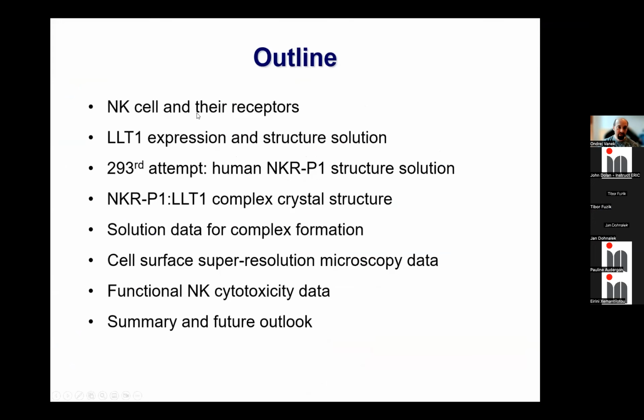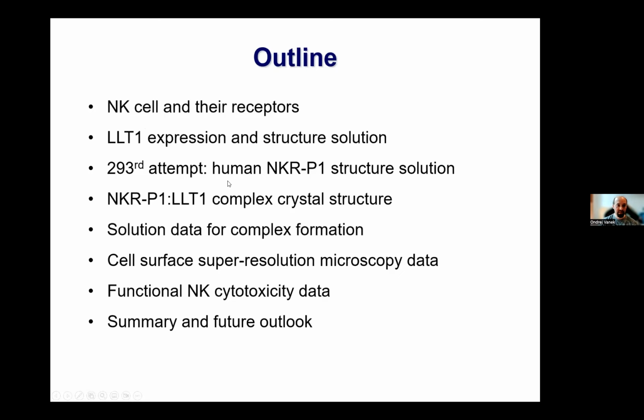In my presentation, I will give you a brief introduction into NK cells and their receptors, and then I will switch to the two of our interest for today and how we struggled with producing them, characterizing, and then solving the crystal structure, and then what we learned from that, combining structural data with solution biophysical data and observation from cell surface using super resolution microscopy, and then functional assays to basically verify or answer the question whether what we observed in the crystal structure is real or not.